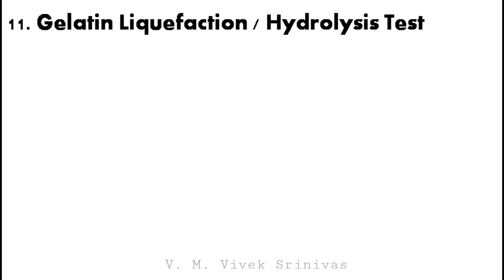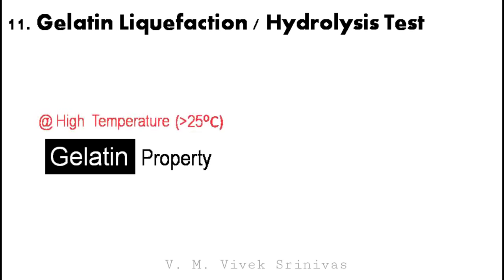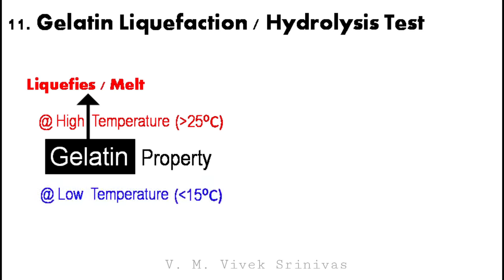Next, the gelatin liquefaction test, also referred to as the gelatin hydrolysis test. In this experiment, gelatin will be used. Before that, we will see the property of gelatin. Gelatin at high temperature, that is, above 25 degrees Celsius, liquefies. In contrast, gelatin at low temperature, that is, below 15 degrees Celsius, solidifies. This is the property of gelatin.